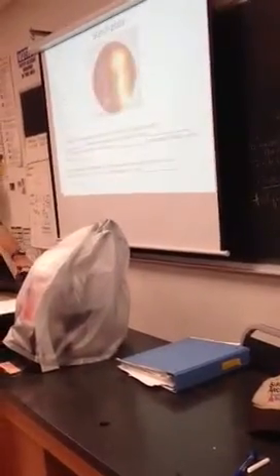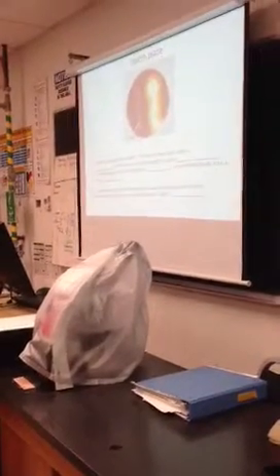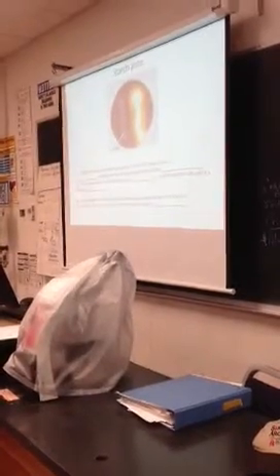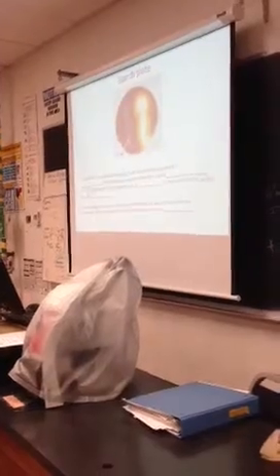Okay, let's go to the next one. This was a starch plate. And Mary, did yours work? Did it work? Okay, good. Remember with the starch plate, you inoculate and incubate, then you add the reagent. Kind of like what we're doing today. We're inoculating and incubating, and we're going to add reagents next time after they've had a chance to grow.